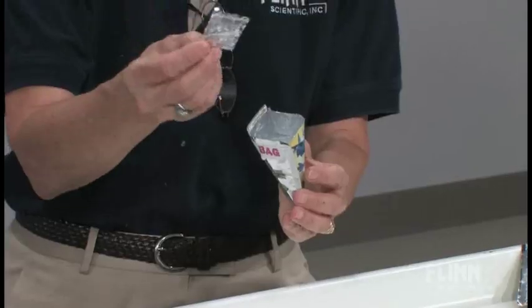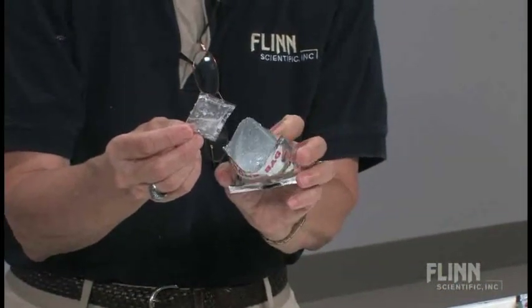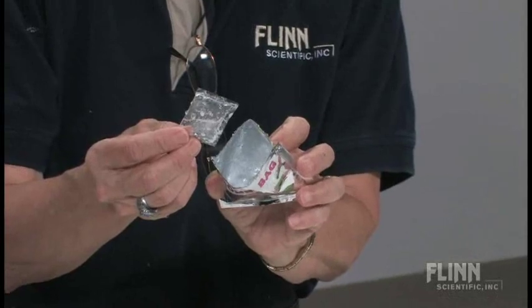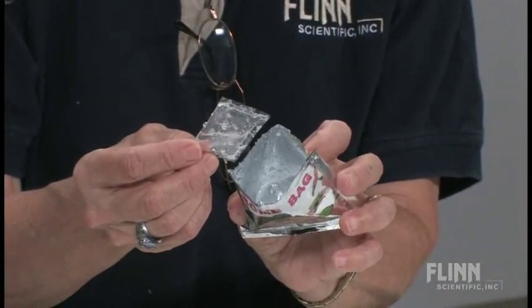We notice that there is a small packet with some liquid. And the inside of the bag, we can see that there is some solid left in there. And of course, we can see that it kind of sprayed all around the lab bench here.